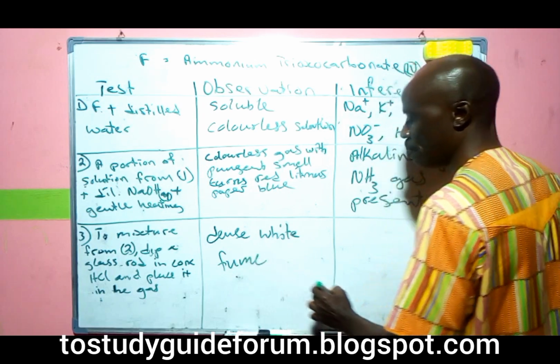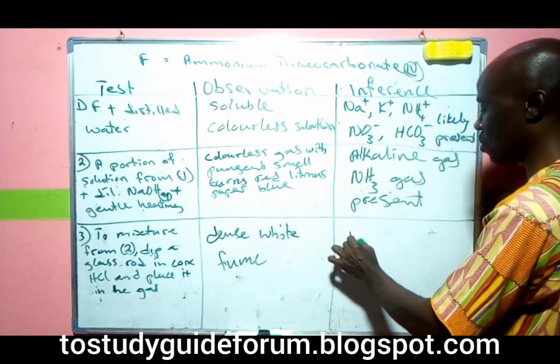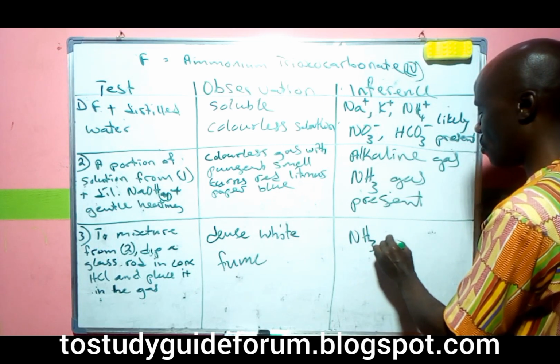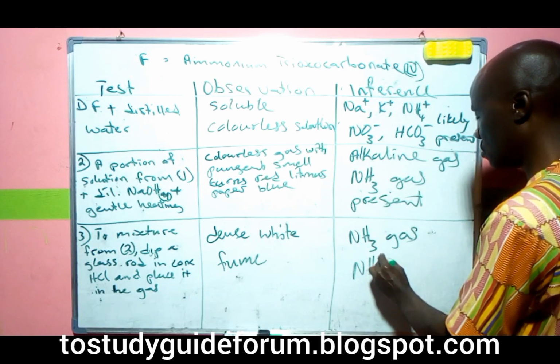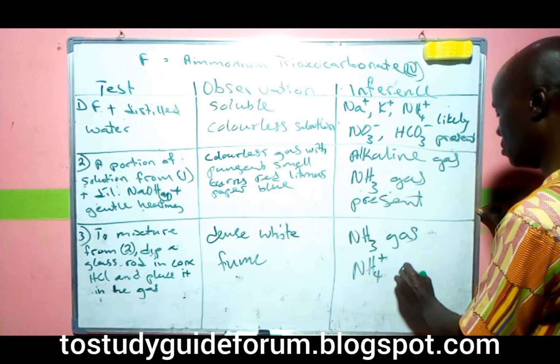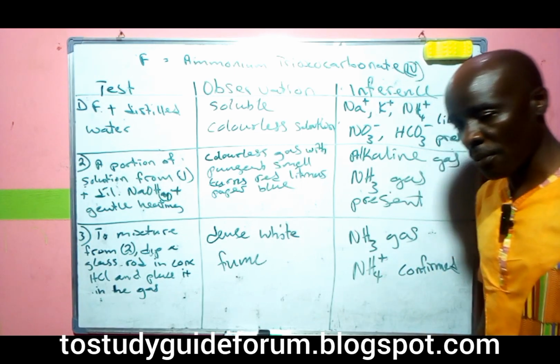This white fume indicates that what you have there is ammonia gas, and the ammonium ion is confirmed.